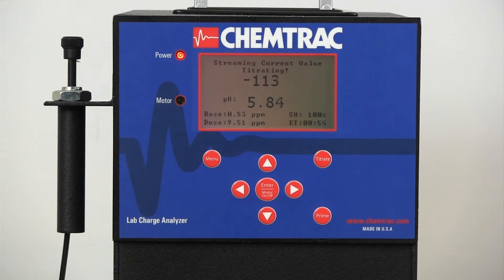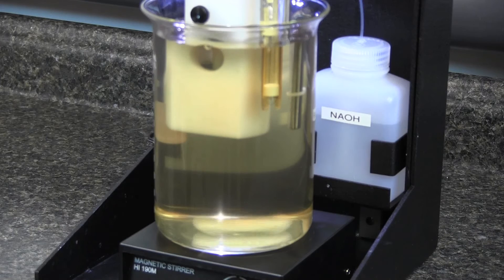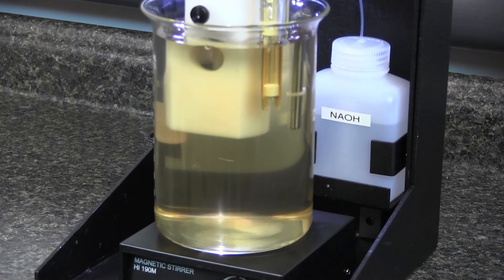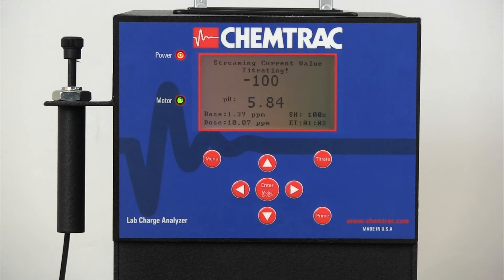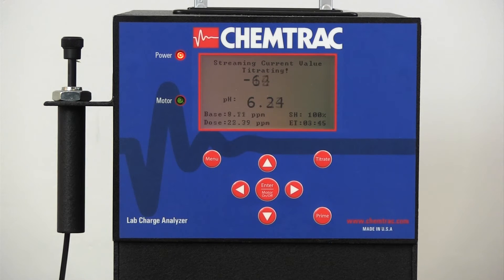As the pH drops below the 6.3 target, the unit begins adding a 0.5% caustic soda solution to gradually raise the pH. The LCA continues the addition of both alum and caustic until a neutral charge value is attained at the target pH.